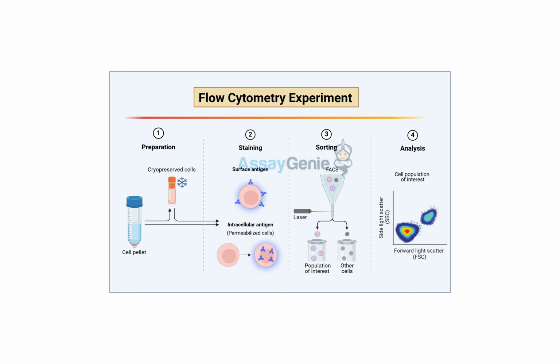What makes that one so challenging? So imagine the cell is like a busy city, and the proteins are all the workers doing their jobs, carrying out various tasks. Now, phosphorylation is like attaching a special badge to a worker. It can give them new instructions or change their behavior. So by studying phosphoproteins, we can understand how cells respond to different signals and change their activities. It's like watching how the city adapts to changing conditions.